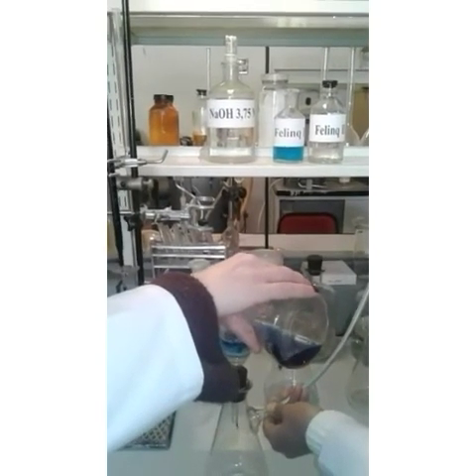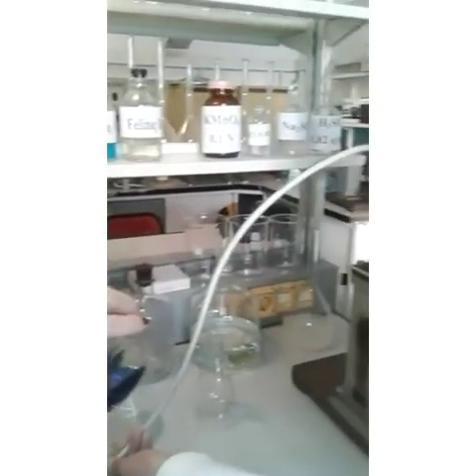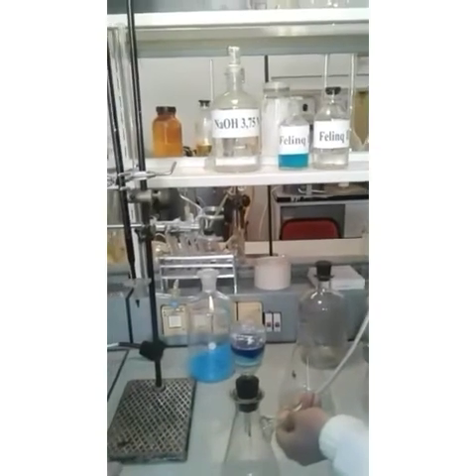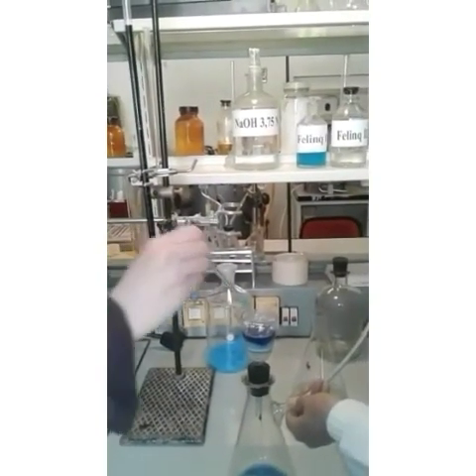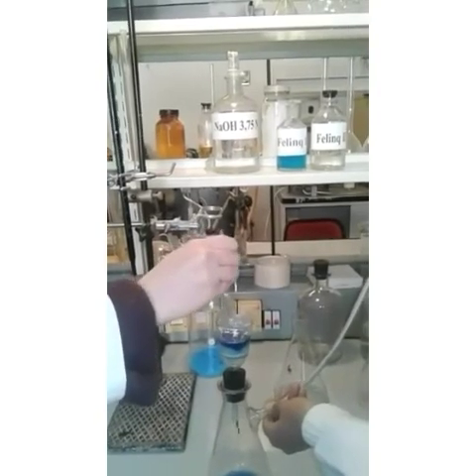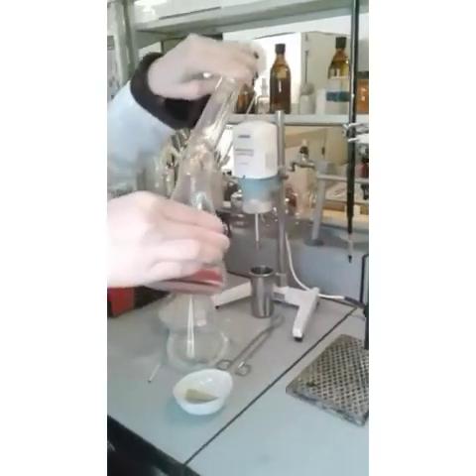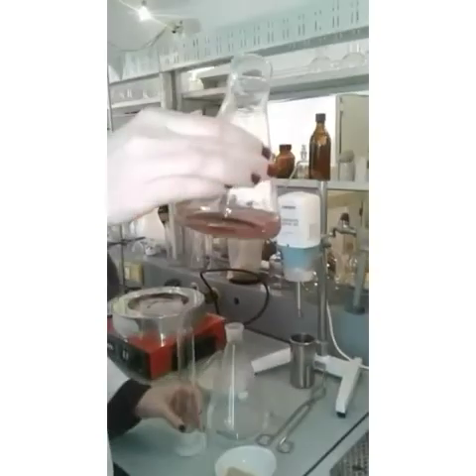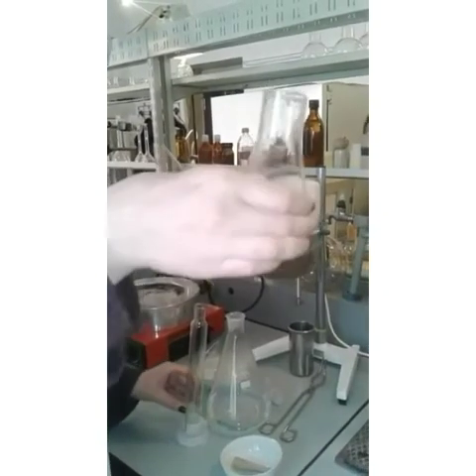When all the liquid above the cuprous oxide precipitate is drained, we add 5-10 milliliters of hot water to the sediment. Water is drained through the filter. This operation is repeated several times until the blue color disappears from the wash water. At the end of the wash, we put the filter into another clean Bunsen flask.